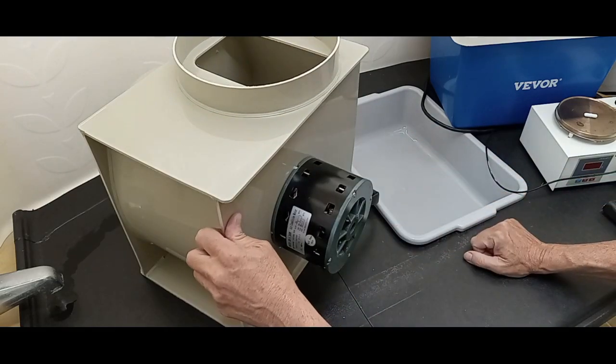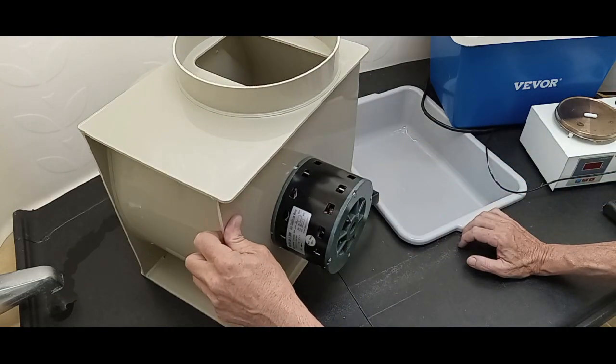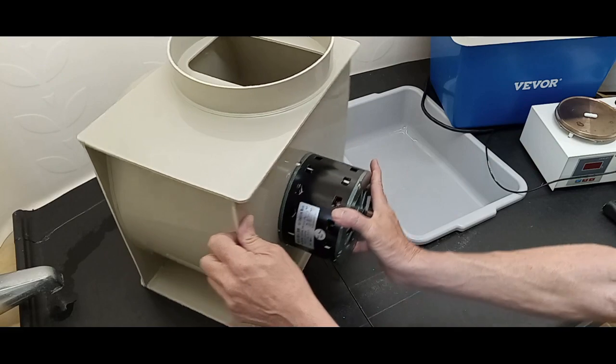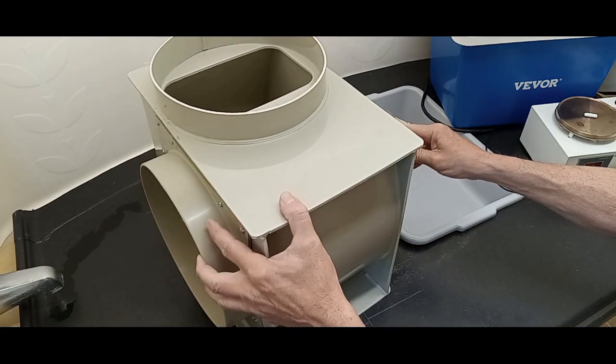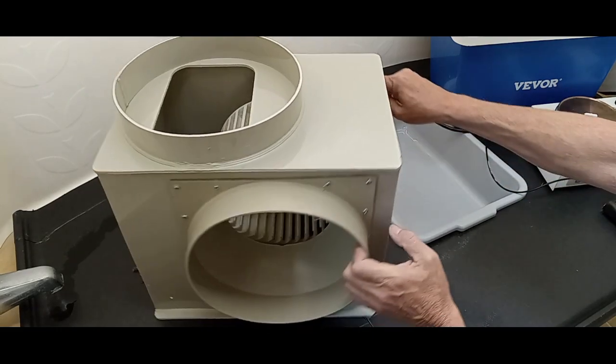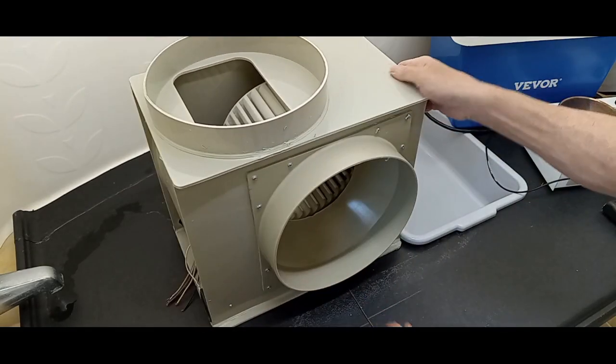if you've done any research and looked for exhaust fans or blowers, chances are you were probably pretty frustrated with the results. Spent a lot of time even at Granger itself, and really this here was about the only viable option.